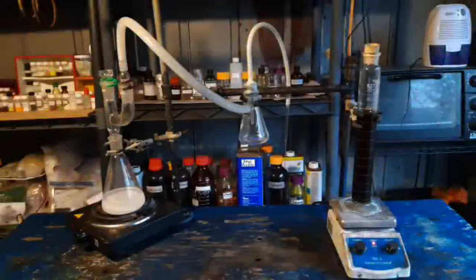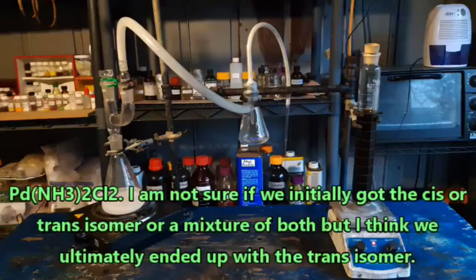Hello everybody and welcome back to the Poor Man's Chemist. In this video we are going to try to make Diamine Dichloropalladium 2, which according to pictures I've seen online is a pretty orange compound. That sounds like fun, so we'll do that.